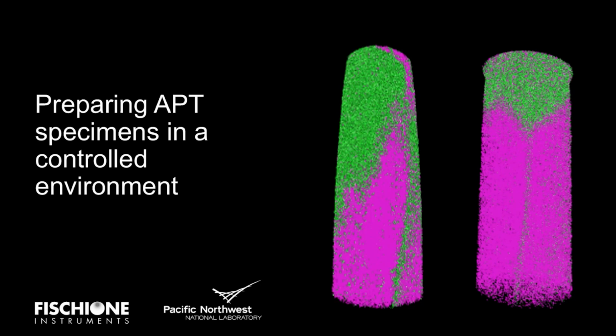So with this oxidation, the sample will oxidize very easily, and you can get very poor signal for EBSD, and the indexing rate will be low, and you can miss a lot of information, especially if you're working on deformed samples.